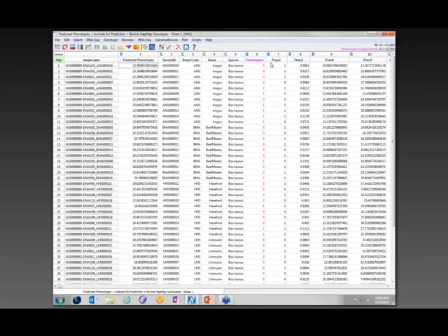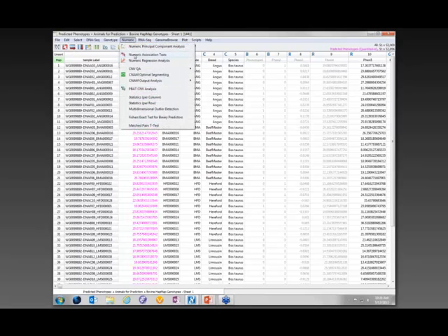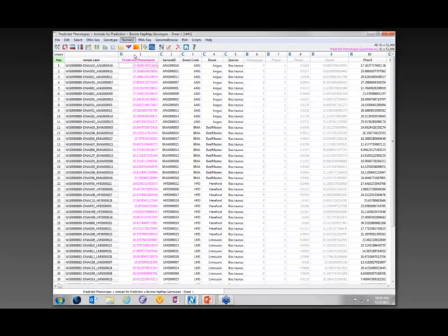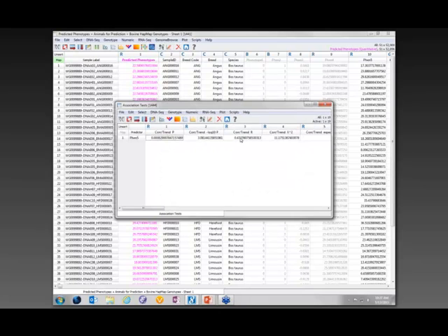So I'm just going to go ahead and inactivate these so that it doesn't clutter the results. We'll set the predicted phenotypes to dependent. Let's just take a look to see how good that prediction did. Run a correlation trend test and linear regression test. And in this particular case, we have a correlation trend R of 0.47.